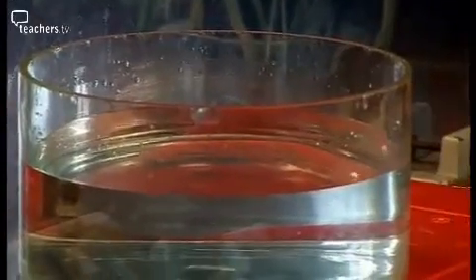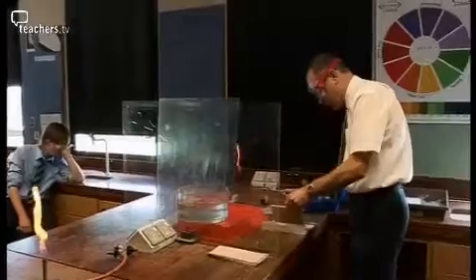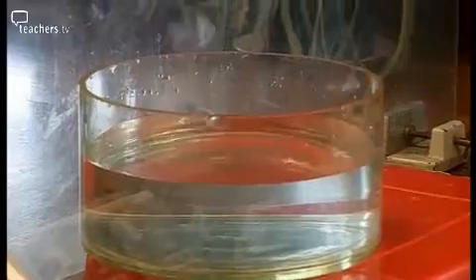Louise? It's reacting with the water. Yep. Moving. Good. Now, potassium. Okay. Can you tell me one similarity already? It's quite soft. Good. Soft again. Cut with a knife. And let's see what it does on the water. Whoa.